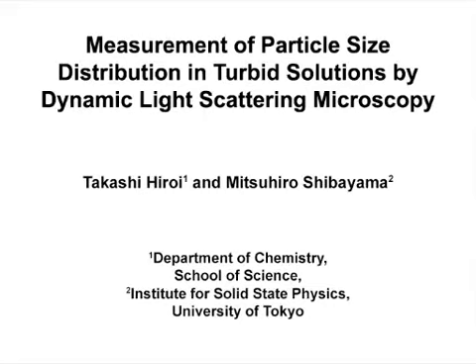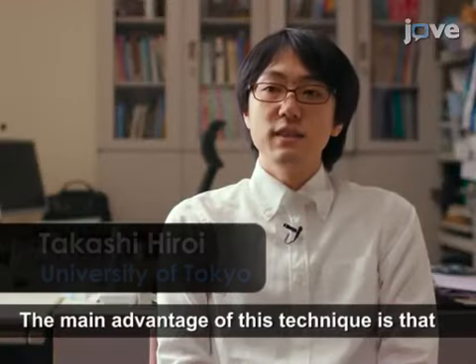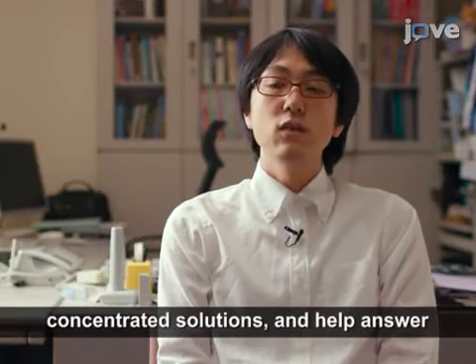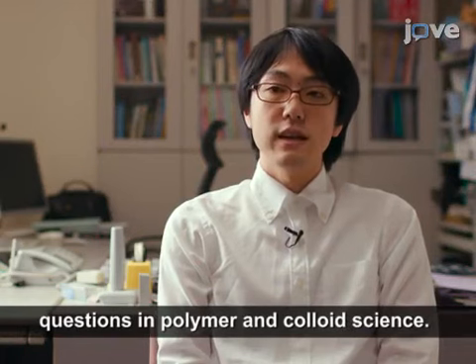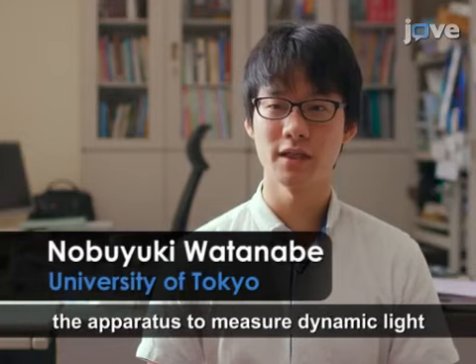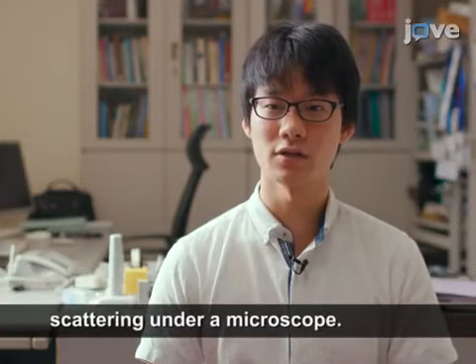The overall goal of this experiment is to demonstrate that dynamic light scattering and confocal microscopy can be used to measure particle size distribution in turbid solutions without dilution. The main advantage of this technique is that it can measure particle size distributions in concentrated solution and help answer questions in polymer and colloid science. To achieve this goal, we developed the apparatus to measure dynamic light scattering under a microscope.